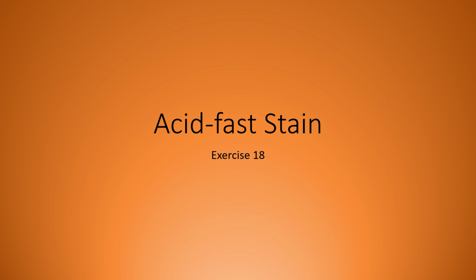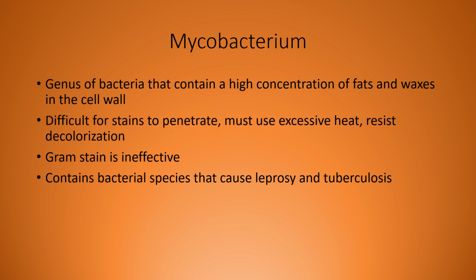So really, you can't say that Mycobacterium are gram positive or gram negative because they really don't handle that stain well. And it's all due to this high lipid content that they have in their cell wall. So if you can't do the gram stain, you're going to have to be able to stain a different way. And what we do would be an acid fast stain in place of the gram stain.